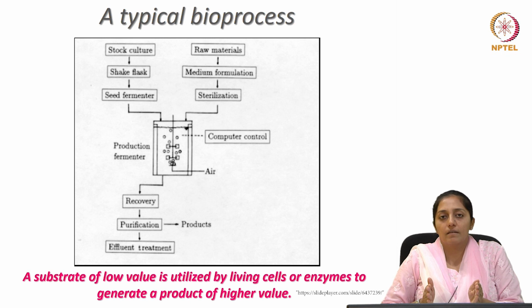This is the portion where various heat transfer and mass transfer operations are carried out in order to enhance or optimize the biological rate of reactions. Then this reactor is also under computer aided control of a biocontroller, where there is automated control of the process conditions. Because these are biologically driven reactions, they work best at a certain set of conditions, which can be physical and chemical.